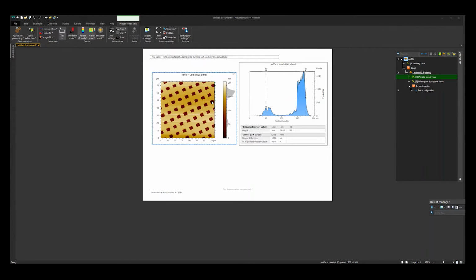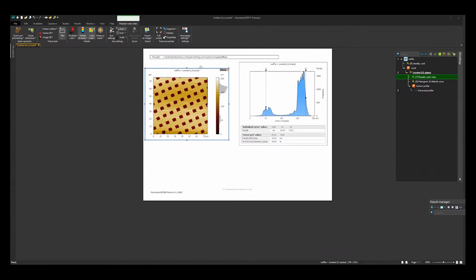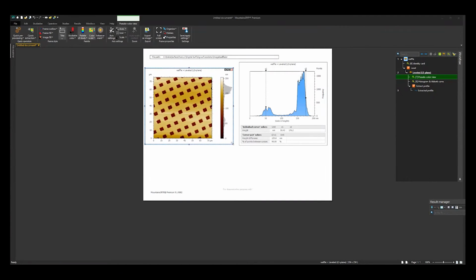The reason we need to process these images at all is due to the nonlinearities and artifacts associated with the hardware in the AFM, particularly the piezos in there. So that's why we need to adjust both on a global level with plane fitting and then on a line by line level to adjust for the artifacts associated with faster scanning. So we're going to start.